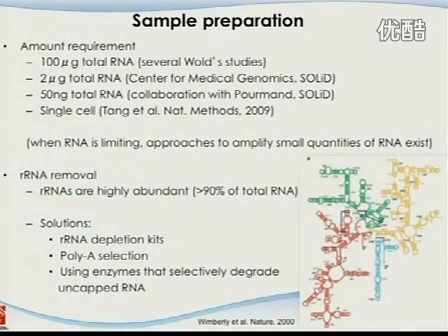Okay. And there's a couple of ways to do the ribosome removal. The first one is ribosome depletion. There are multiple kits, Ribo-Zero and things like that, which is very good. Another way is to do the poly A selection, right? Because we know that messenger RNAs, including a certain level of long non-coding RNAs, are polyadenylated. So when you do the reverse transcription, you use the poly T, and you probably can get those messenger RNAs, but you will get rid of ribosome RNA because they are not polyadenylated. Okay, and I will talk about it in the next slide. There are issues on that as well.